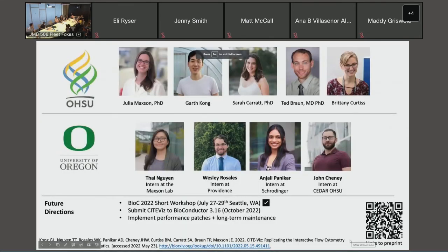So this really is a Blade Runner reference, but can you enhance and then enhance on your gating? Because that is something that flow cytometrists love to do, is enhancing on those gating options, right? Is that something available in your app? Just zooming in. You're just zooming in. Sorry, maybe too old of a reference.